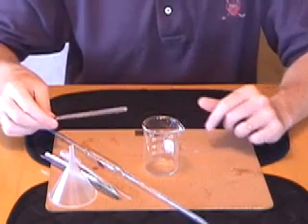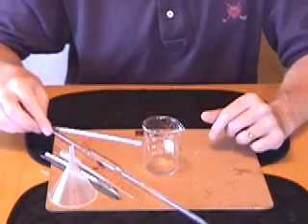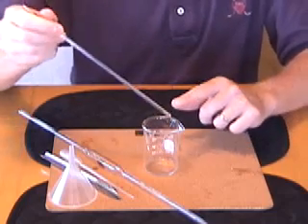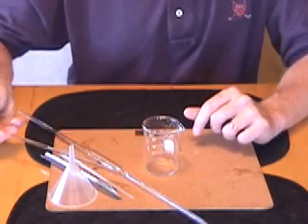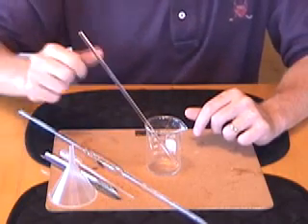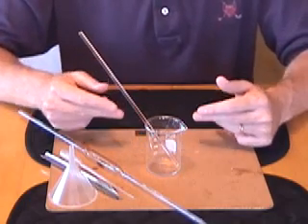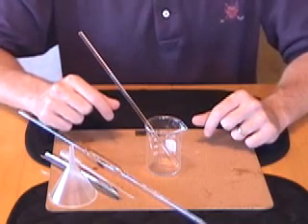Well, don't fill it up to the 100 milliliter mark on the beaker, because beakers are a very inaccurate way of determining volume. Hey, by the way, if you had some solid on this stirring rod, you would then lose it as you put it down on a lab bench. So you would never want to do that. Watch this. So what you want to do is make sure that this solution gets prepared into a piece of glassware that will accurately give you 100 milliliters.